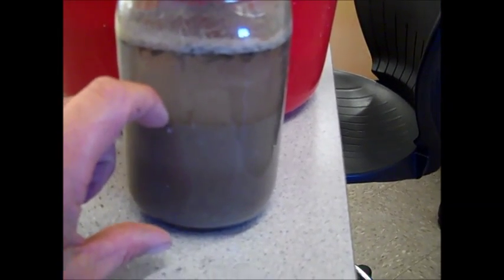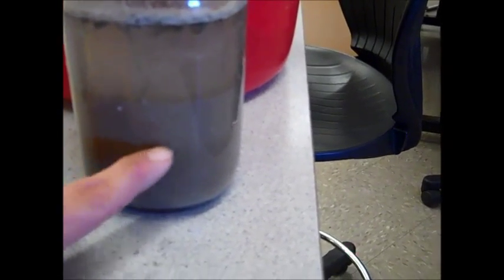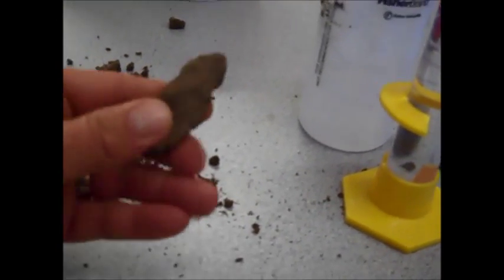So you look at this, and you can even put a ruler next to this, and you start to assign percentages. I see a very distinct line here between what looks like sand and what looks like clay. I'll have to let this settle out a little bit more. I knew that my soil had a lot of clay in it because I can do this. I can ribbon quite a ways.